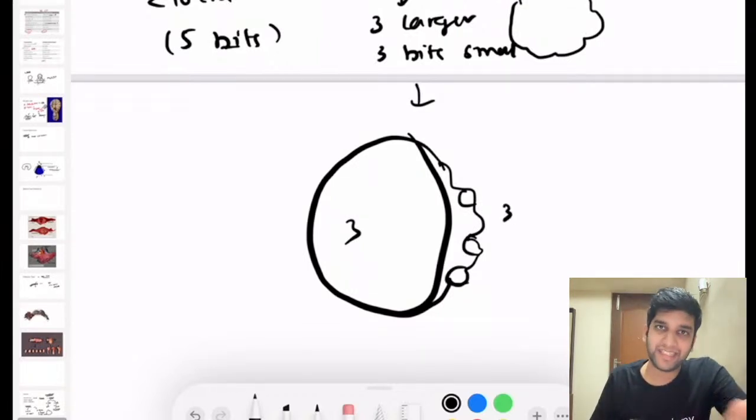Number of bits is still enough. 5 bits to 6 bits is still enough if and only if it is homogeneous. If it is not homogeneous, if it's heterogeneous, I have to sample as much as possible from the heterogeneous area.